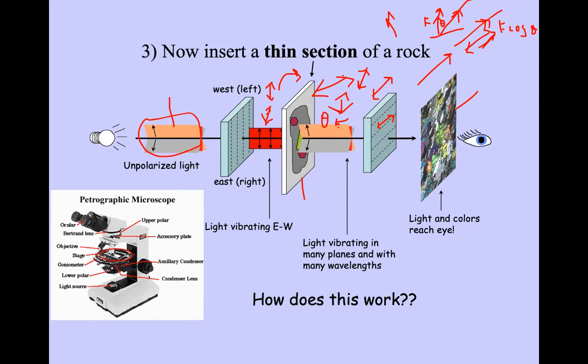These different colors, green, yellow, black, are also important for identification of minerals, because each and every color is again a characteristic feature of a mineral. To distinguish the mineral from this green one to the orange one, we have to use this color and some other properties. Some other natural color parameters we can observe here for mineral identification.